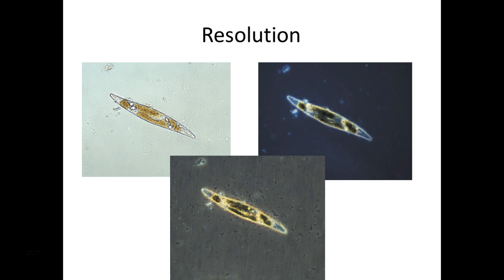So all of a sudden, when you look at this picture, right, you're not just seeing the euglena, are you? Are you noticing there's other stuff that's much smaller that you really did not notice, especially in bright and maybe a little bit in dark field microscopy? So there are actually other organisms on this slide or this specimen that were too tiny, right? They weren't stained, and so you weren't really visualizing them. By using phase contrast, it helped create that little bit of contrast that you needed to be able to see them.